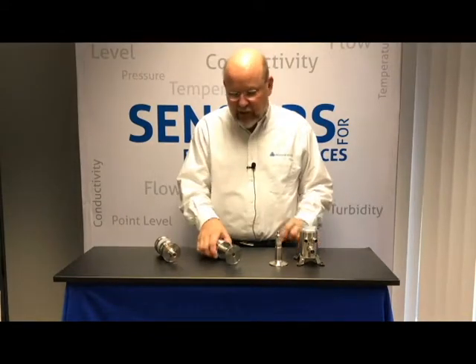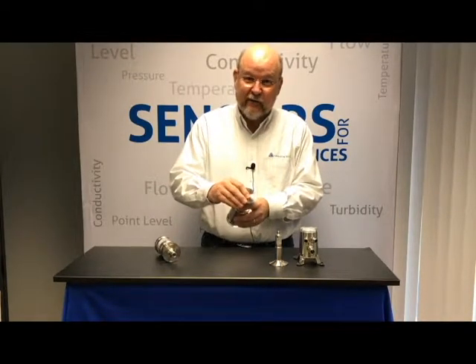Turbidity is the measurement of the effect that particles in a media will have on light. So what we do is we impart a beam of light into the media and we look at the effect that the particles will have on that beam of light. In particular, in the case of an ITM 51, we have a process connection, a tri-clamp connection with a sapphire lens.